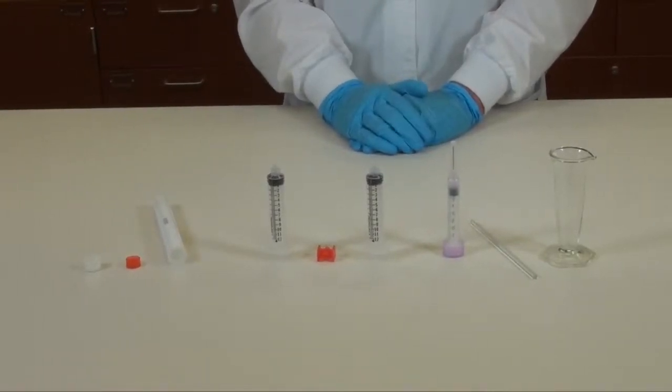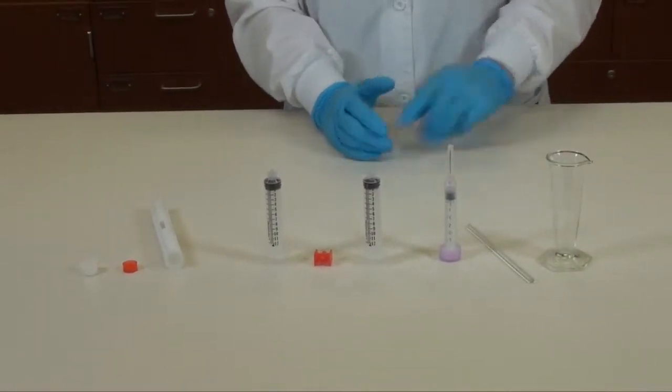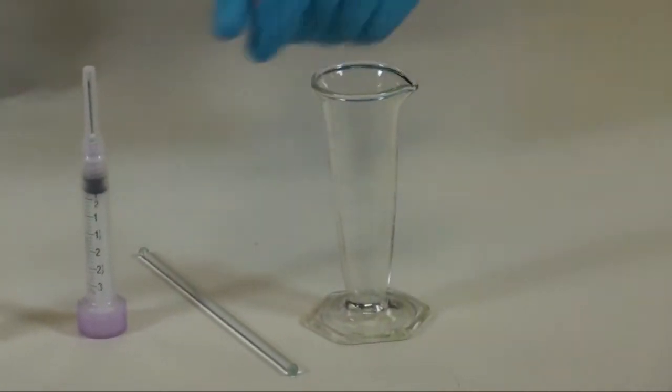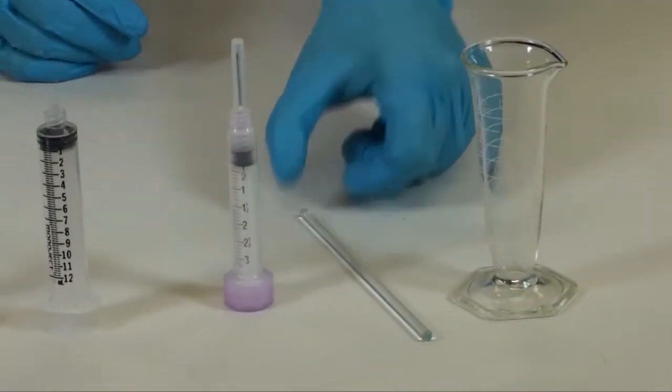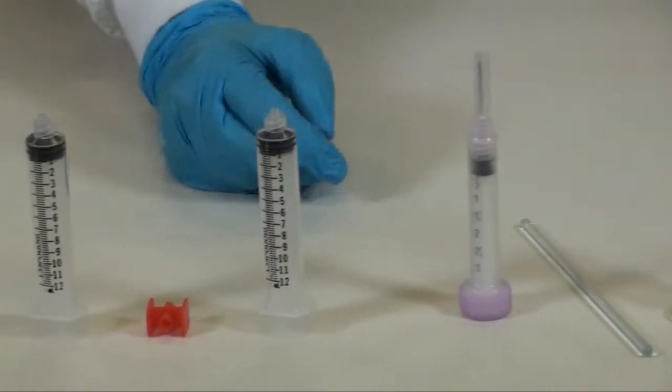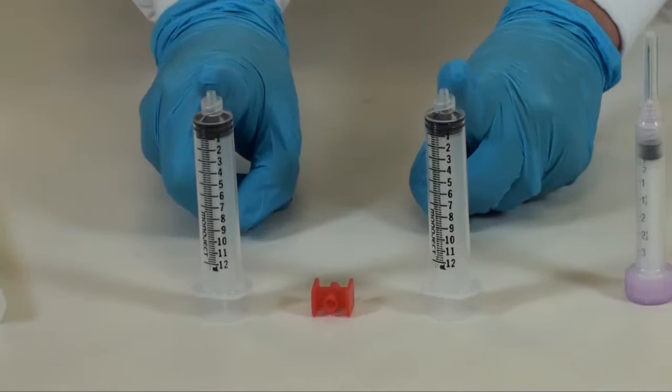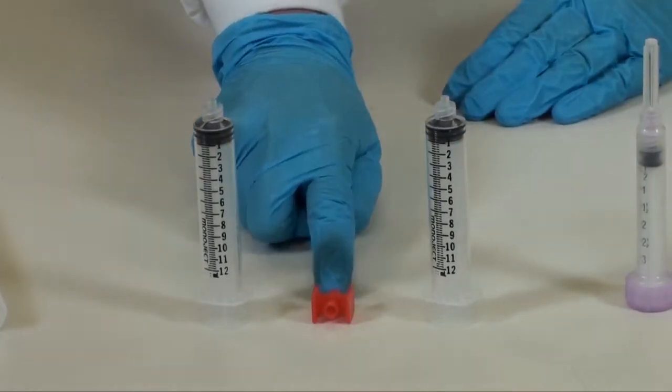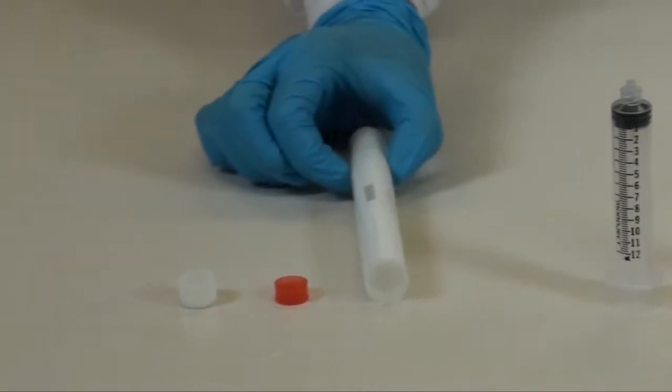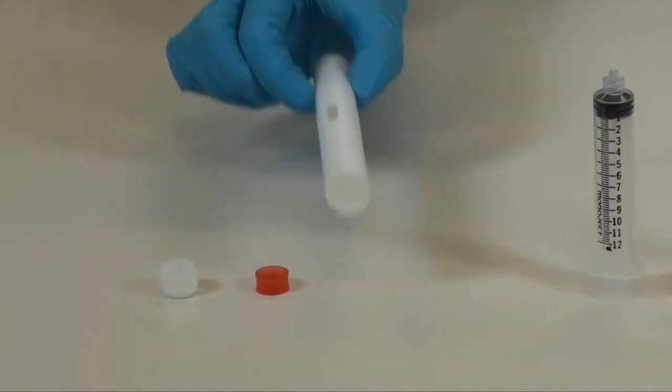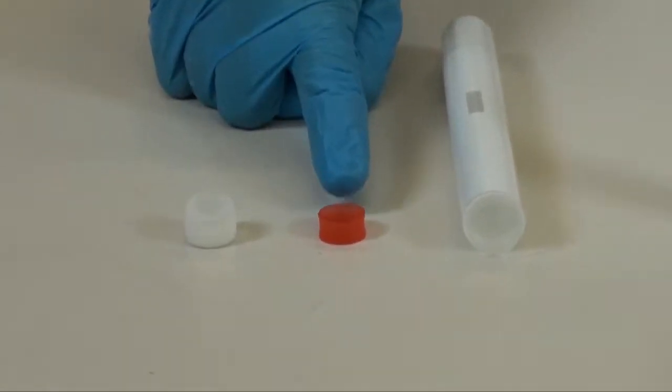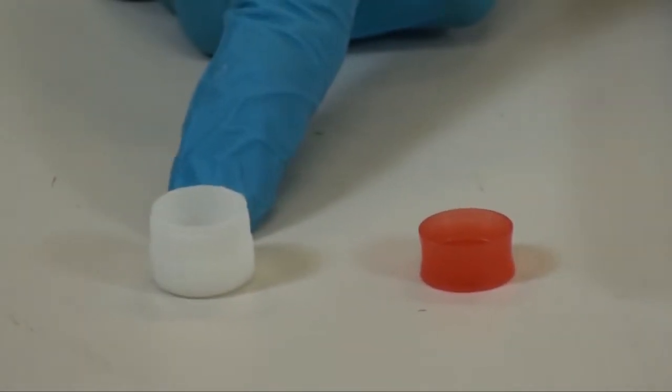The supplies required for the PLO gel this week will be a one ounce graduated conical, a glass stirring rod, a 3ml syringe with a needle, two 12ml syringes with this red syringe connector, and an AccuPen that comes in three pieces: the tube that you load the final product, the red cap, and then the end cap.